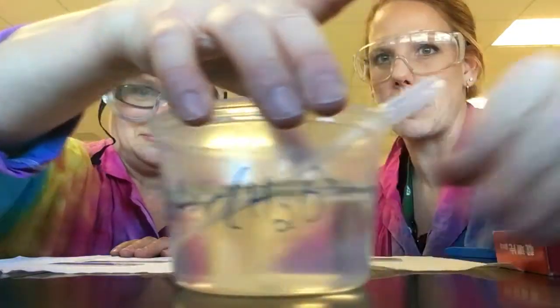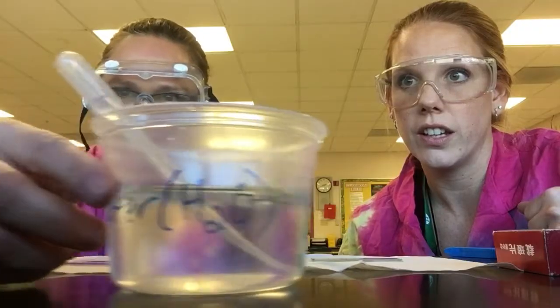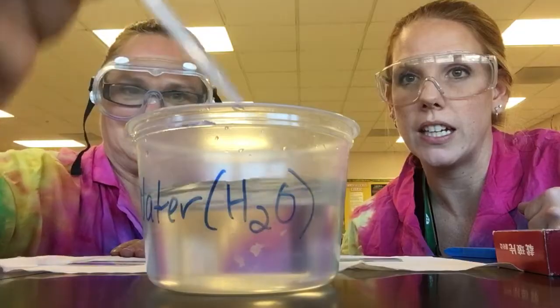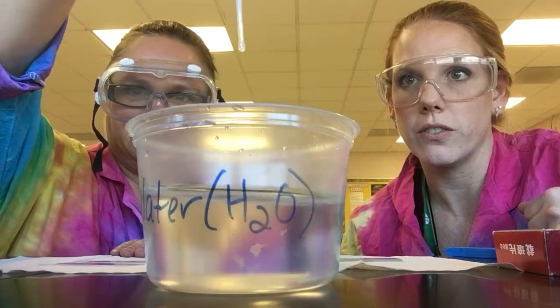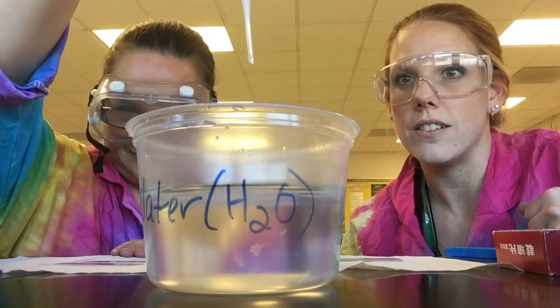Wet mounts are a little harder because they involve using a new tool called the pipette. A pipette is similar to an eyedropper — it works the same way in that you squeeze your fingers together to fill it up, and then squeeze your fingers together out of the water to create drops. You want to make your drops as consistent as possible.